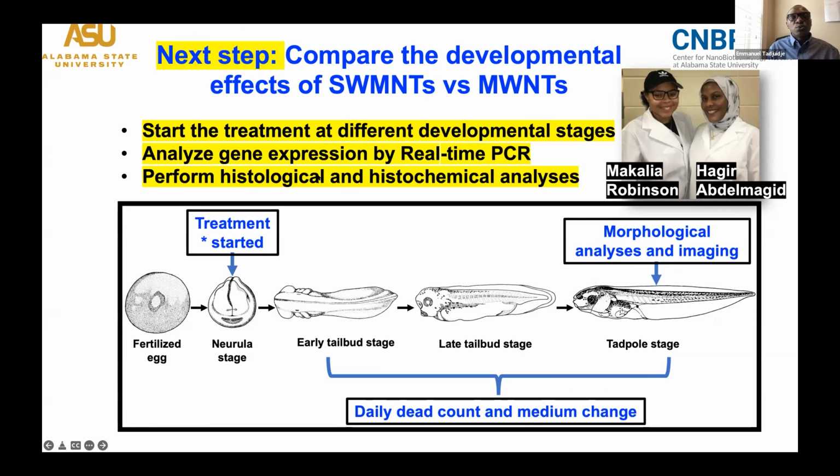What we're also planning on doing is sectioning these embryos to perform more histological analysis to determine what the actual defects on tissues are in those embryos that show the phenotype that we observed.